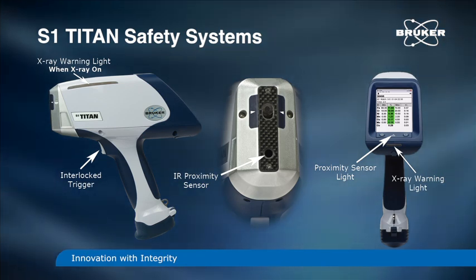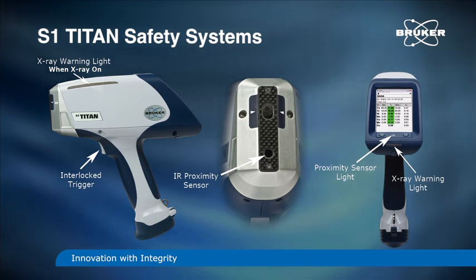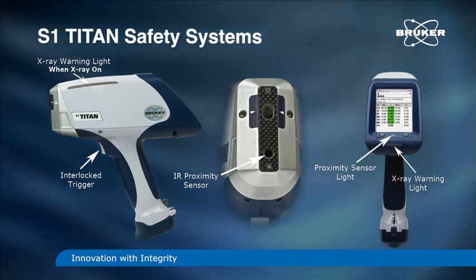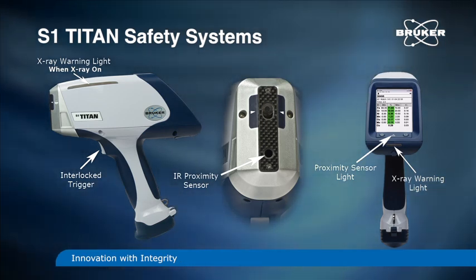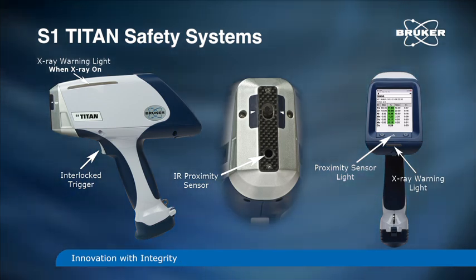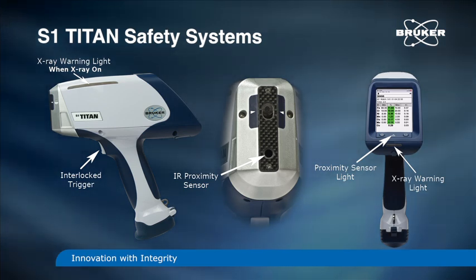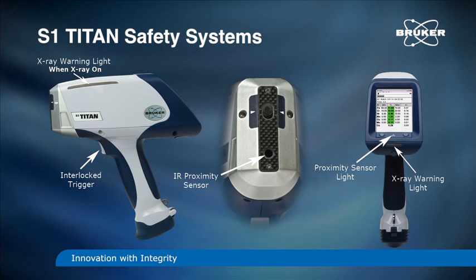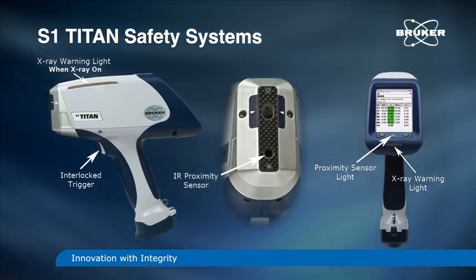These include password protection, software X-ray warning, infrared IR proximity sensor, operator trigger interlock, red X-ray warning light, minimum backscatter detection, X-ray annunciator, operator timeout.